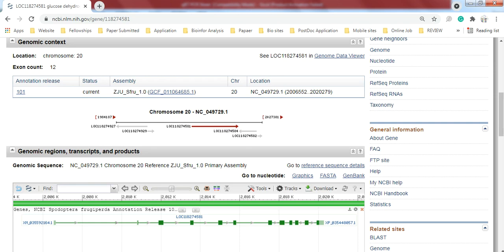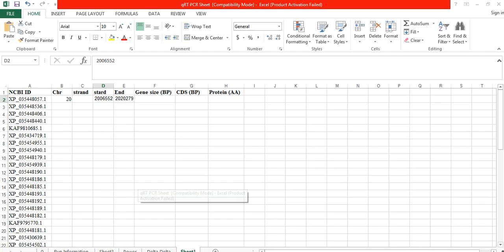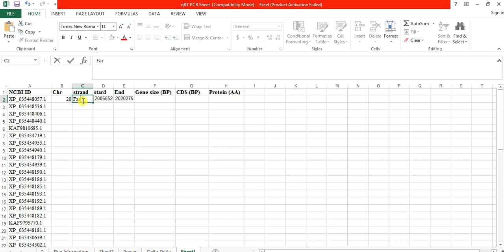And here is the strand information - whether it is on forward or reverse strand. The arrow sign shows towards the right, so it means it is forward strand. It is on the forward strand. If the arrow sign is towards the left, then it means it is on the reverse strand.